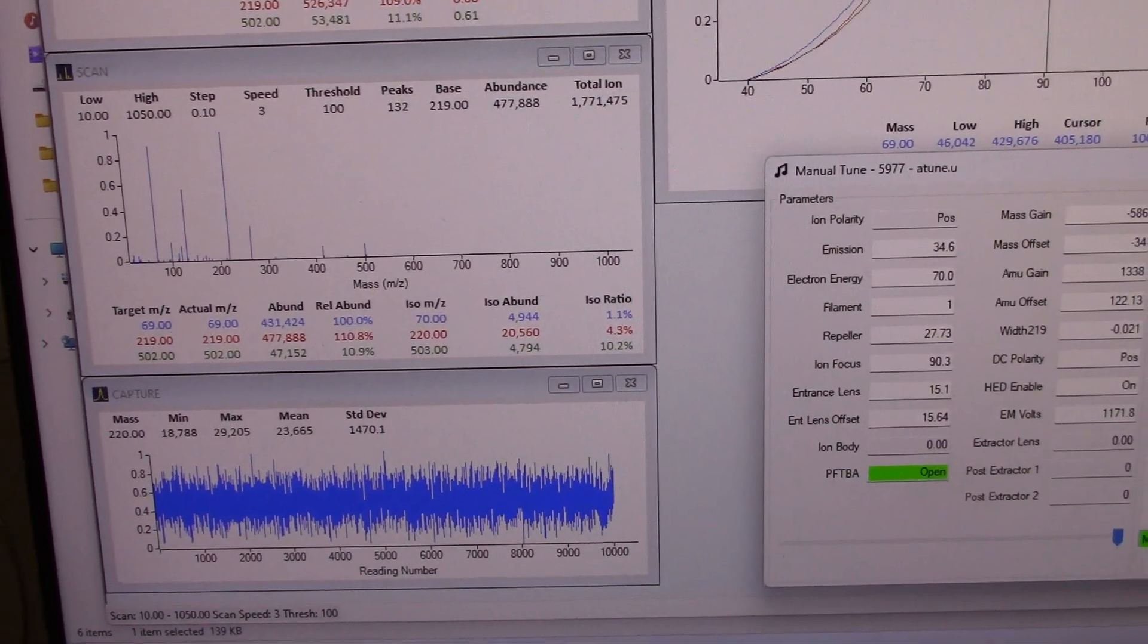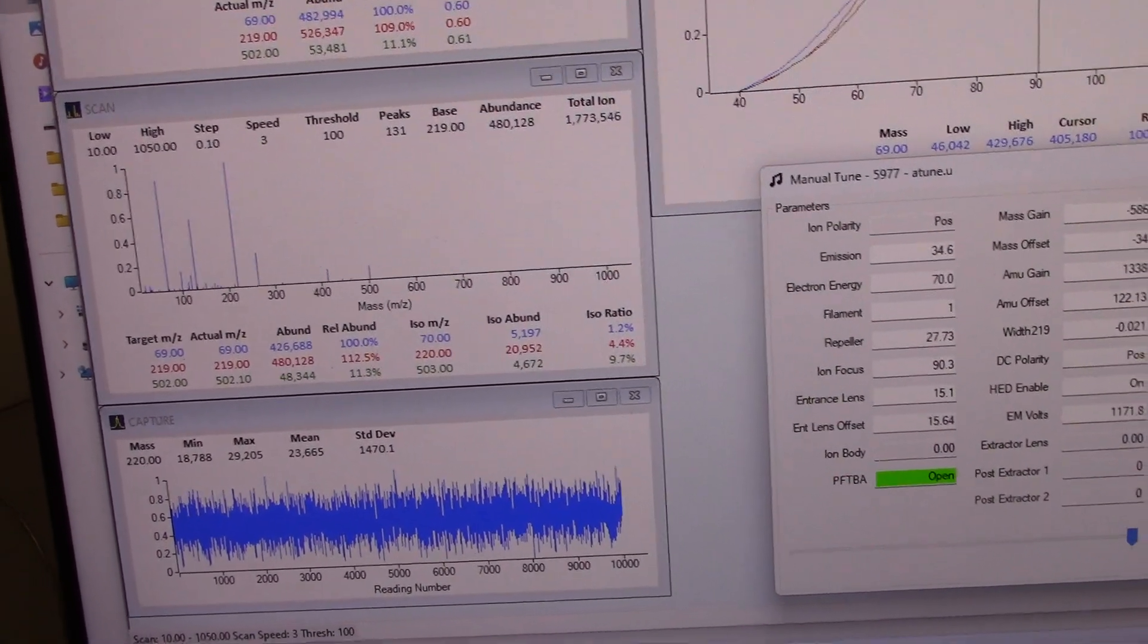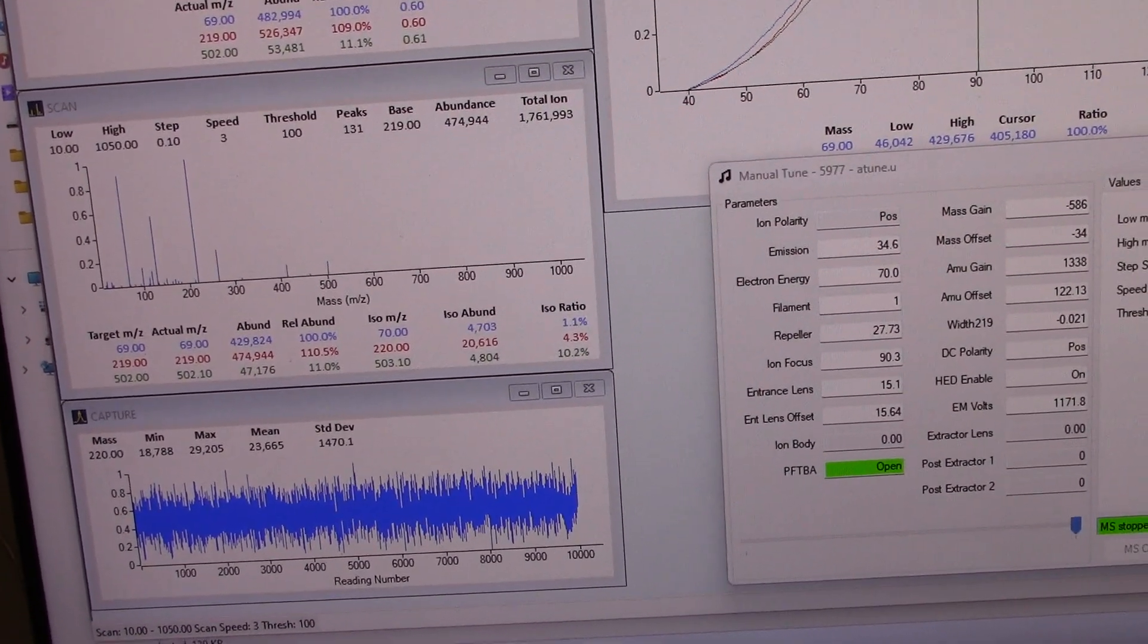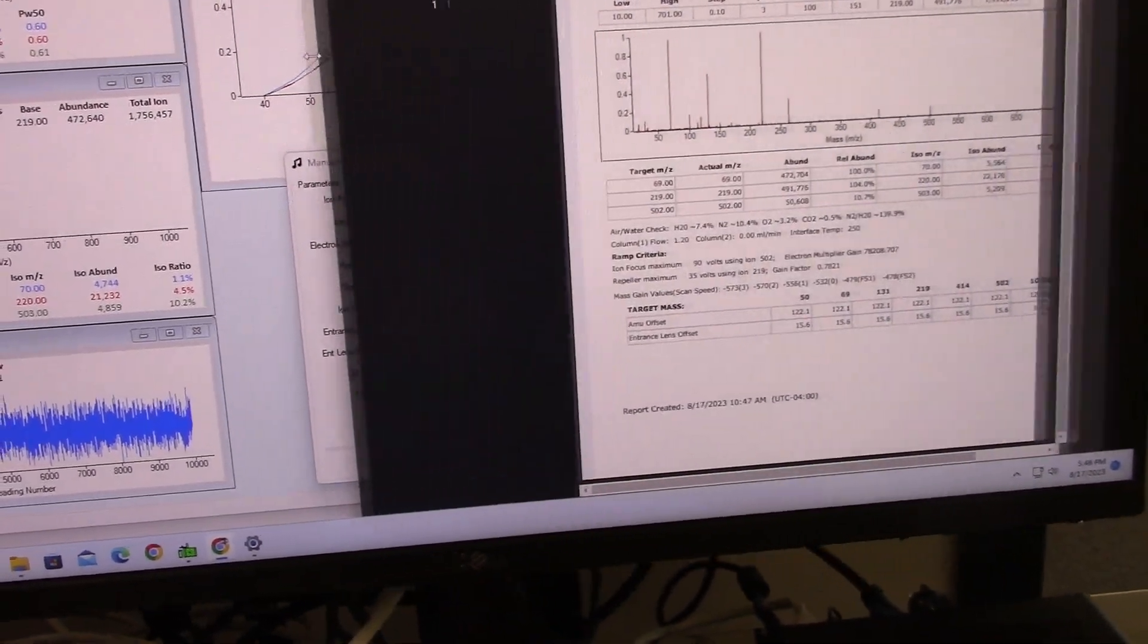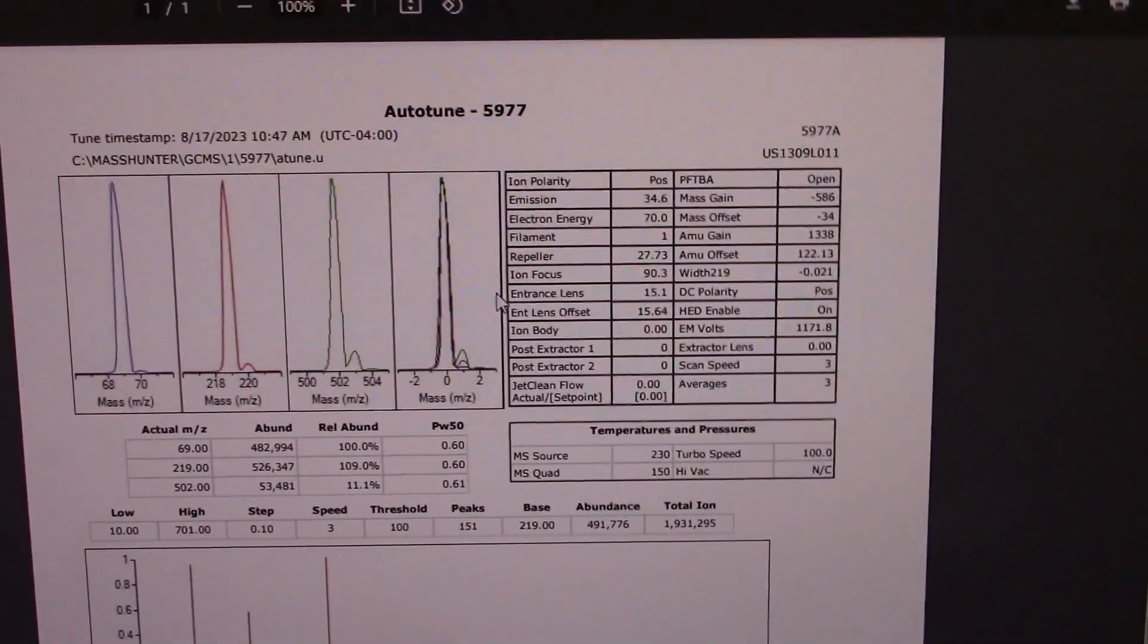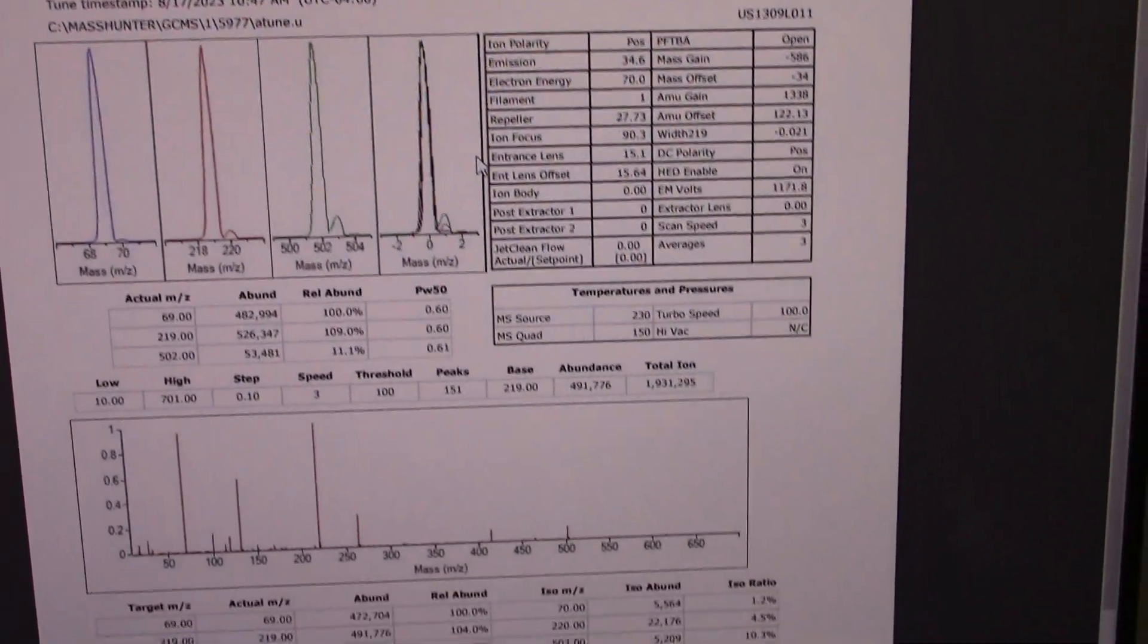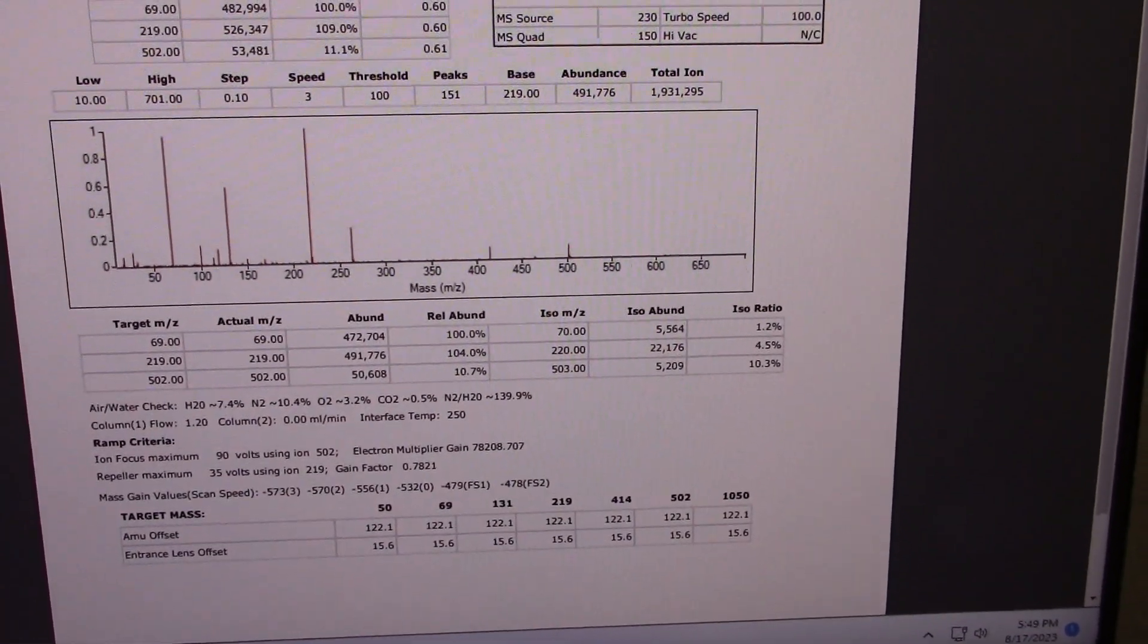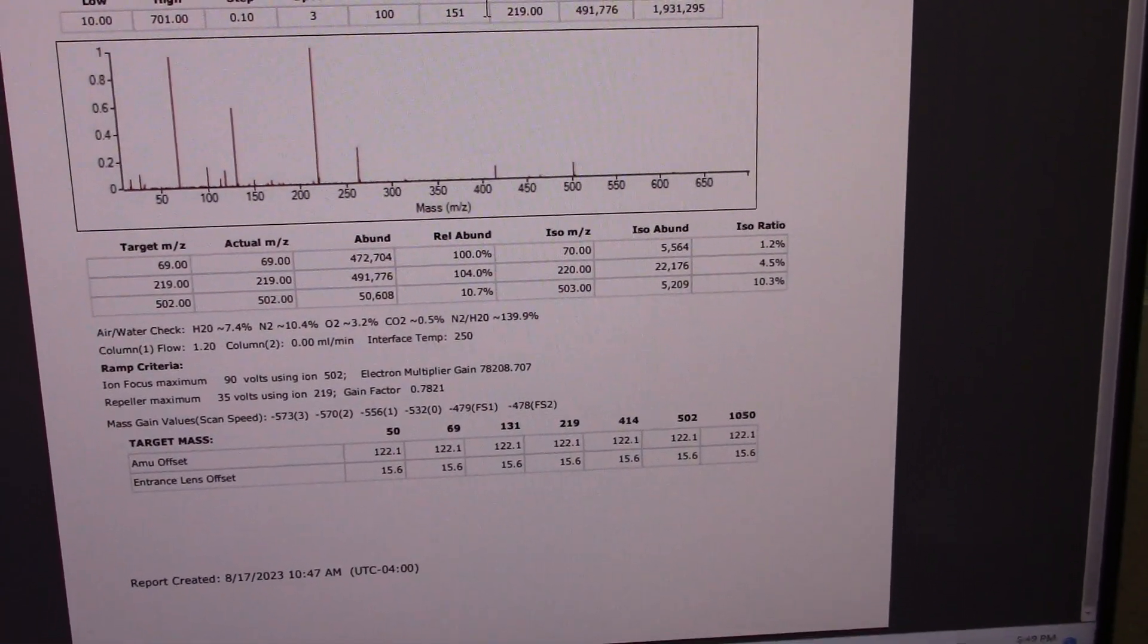Looking fantastic. Earlier today we did an auto-tune. Everything looked great.